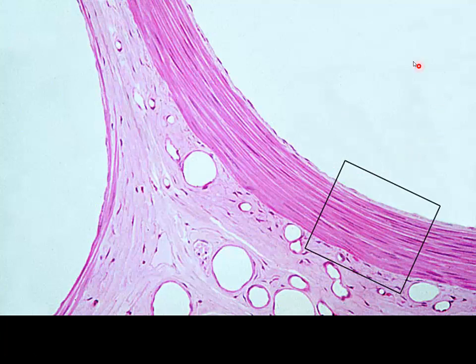So in this section, lumen on this opposing side, and from the previous illustration, we know that these are fairly large luminal diameters, but here we have a fairly thick muscular layer. Here we have just a couple of layers of smooth muscle before we get to the adventitia. So here we're going to have a muscular artery, and here we're going to have a vein.